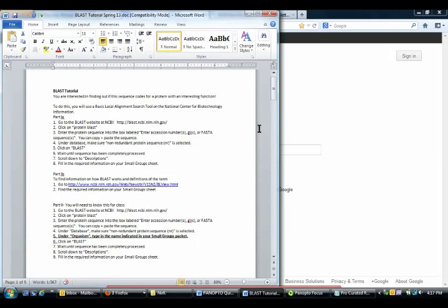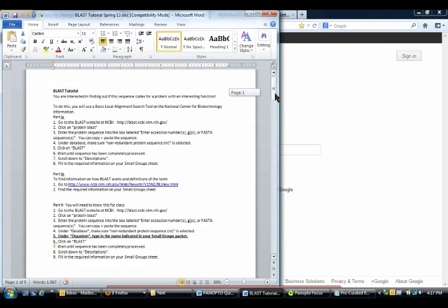Welcome to the BLAST tutorial. First, open up the BLAST tutorial Spring 2013 document.